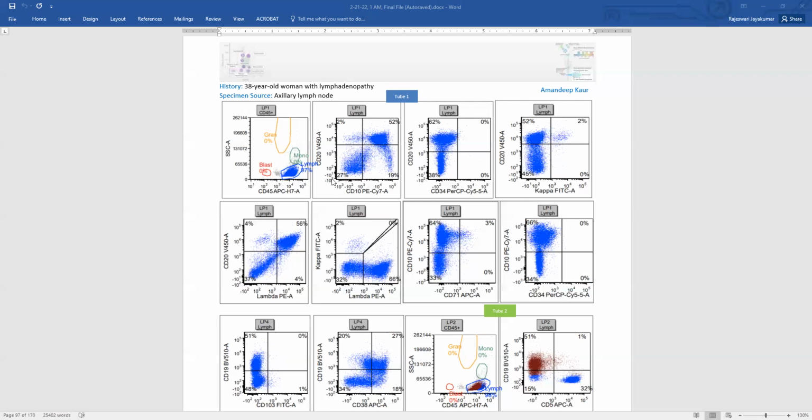So Burkitt's and diffuse large B-cell lymphomas and high-grade follicular lymphomas are composed of large B cells, so they usually have high side scatter. But sometimes, those large B cells disintegrate faster. So this is a very helpful element. Having low side scatter helps in saying that these are probably just low-grade B cells. So possibly this is just a follicular lymphoma, but do not go by that.